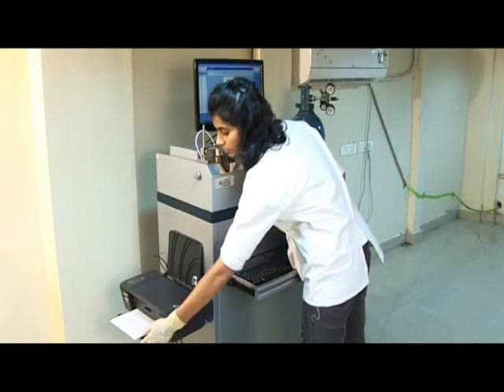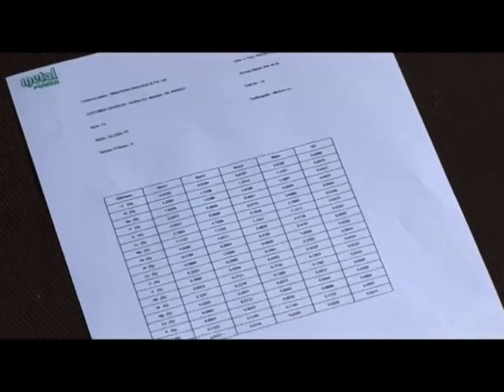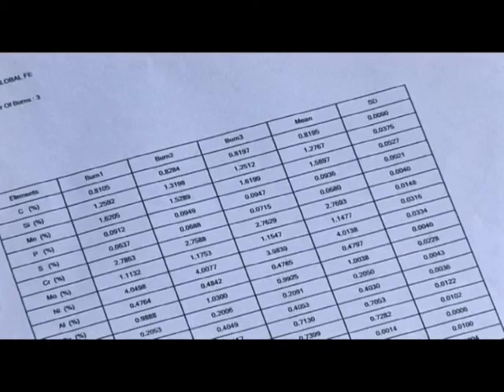A printer connected to the PC can be used to print the final results. This report format can be customized.